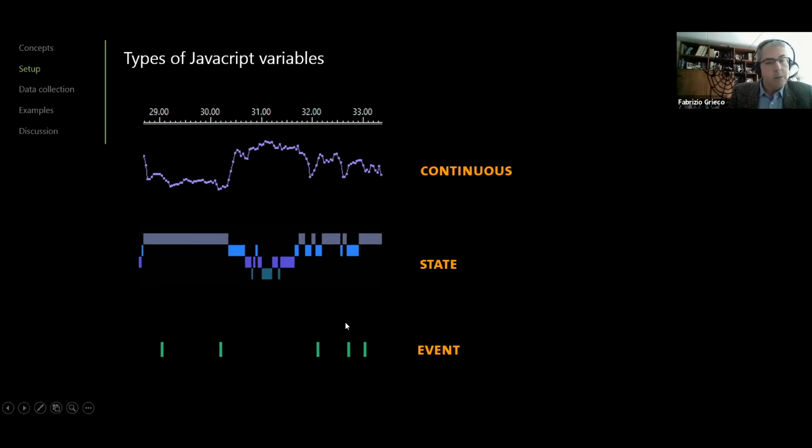So now we just skip the data acquisition here because there's nothing special that I could talk about, because I simply assume that we have the data already. So we have track data with clean coordinates, no missing sample, or a small number of missing samples, no misdetection. So good data, just ready for the next Nature paper.